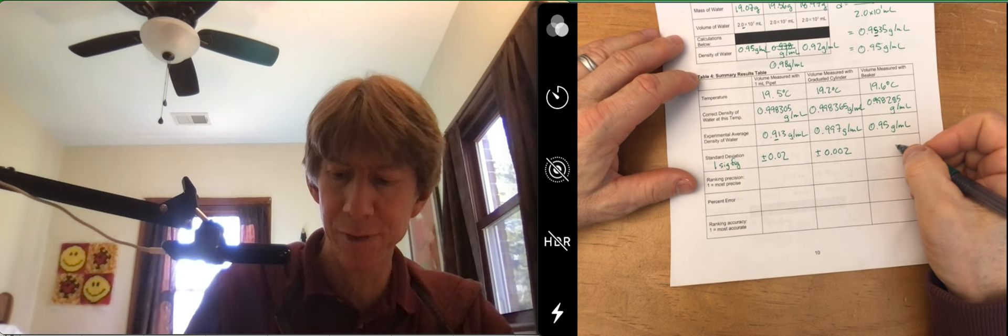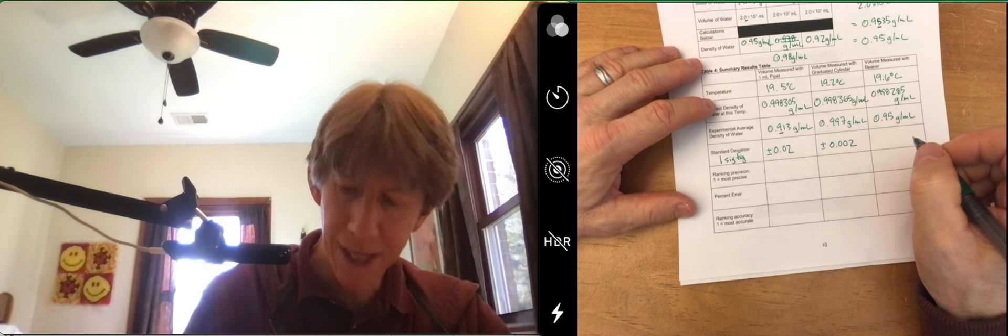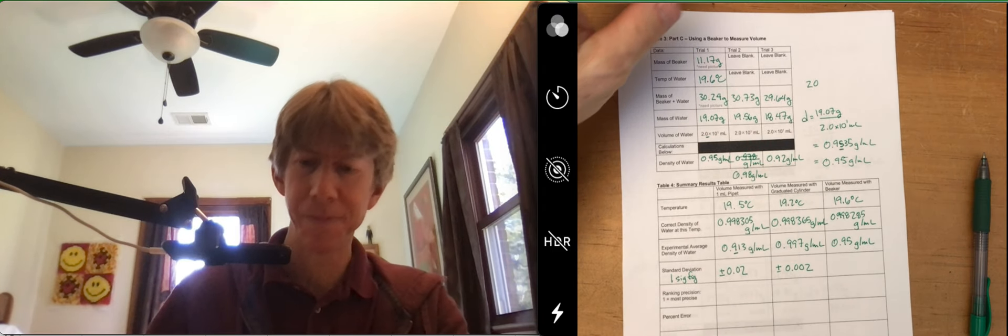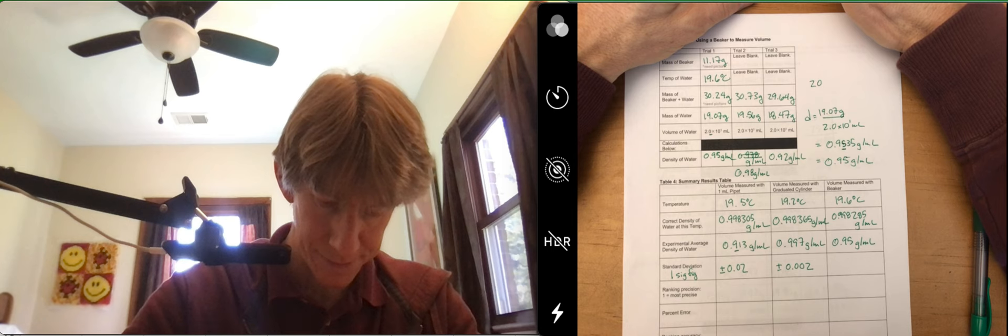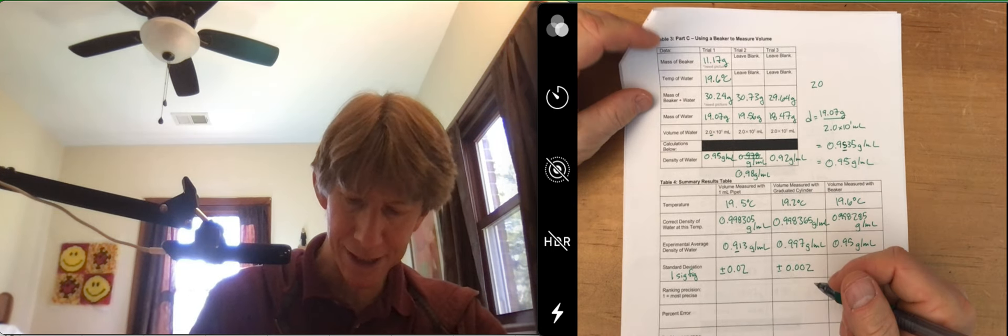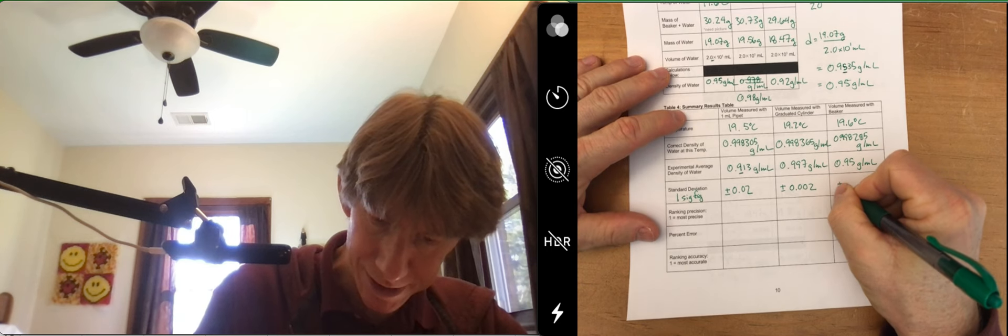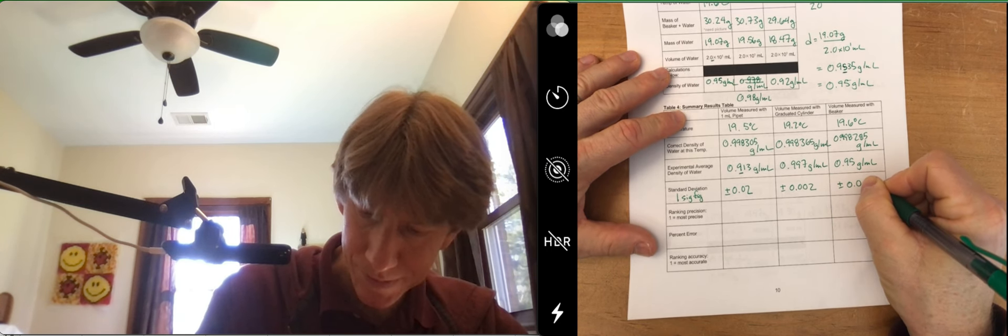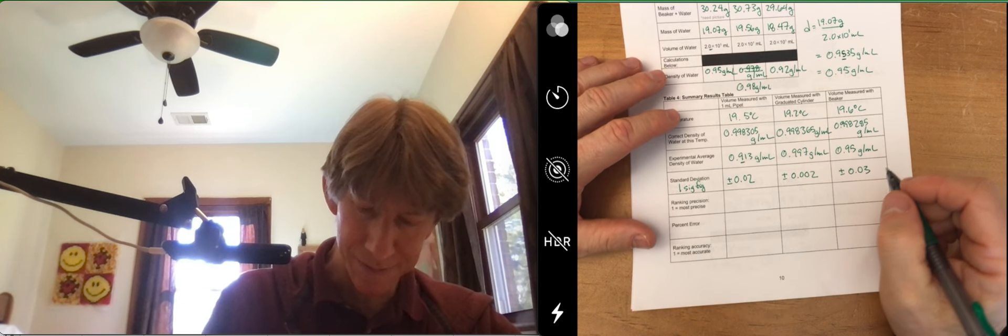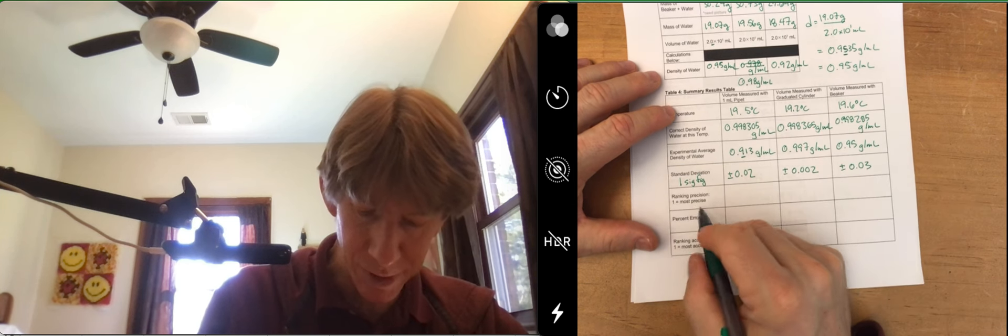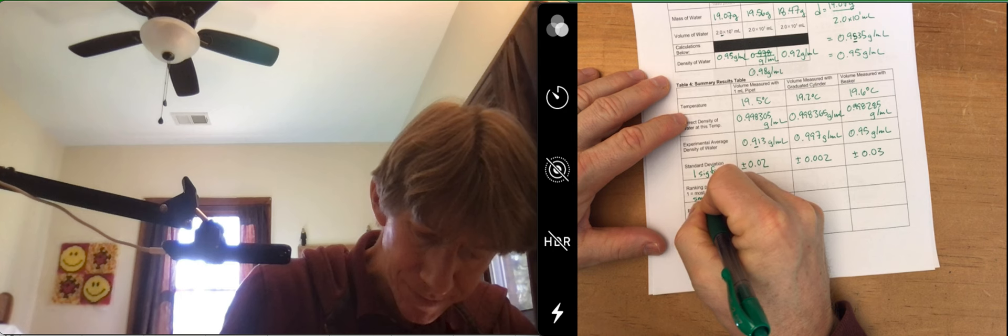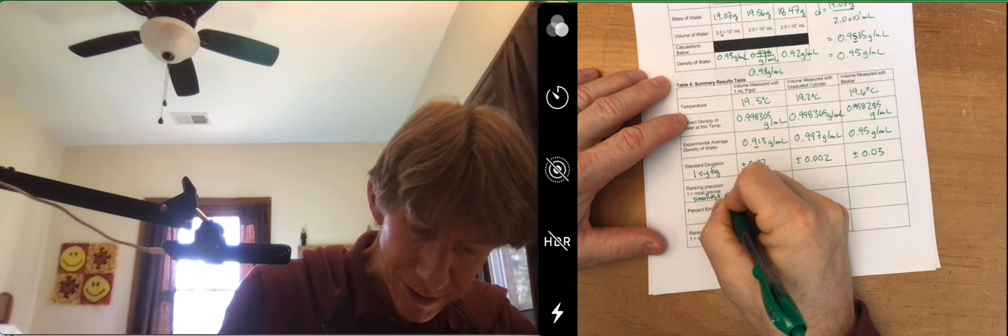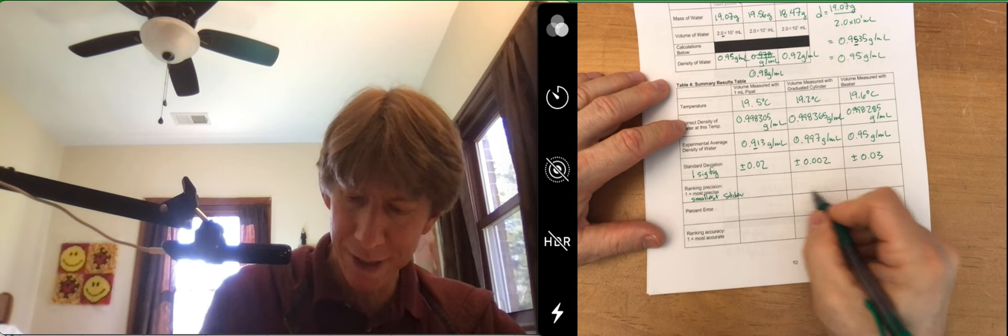And the third one for the beaker will be similar. Let's go ahead and do it because I have to rank precision. Well, I hate to say it, but it's going to be plus or minus 0.03. Now, ranking precision, most precise has smallest standard deviation. The smallest one is here, so this is the most precise.